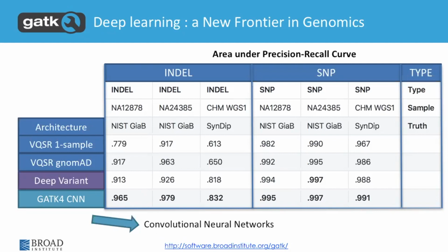Assuming you're asking about the clinical application case, I think what you would do is train the model once and then systematically apply the same model. As long as you're applying the same model, the results would be deterministic. It doesn't have different weights during interpretation. They are really fixed. They do not vary. Once the model is trained, all the weights are fixed. So if you apply the same model to the same data over and over again, separately, you will get the same results to reproduce it.